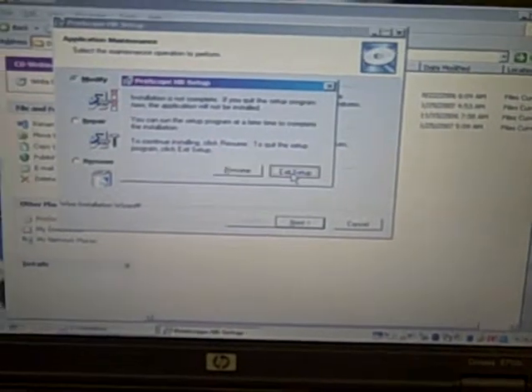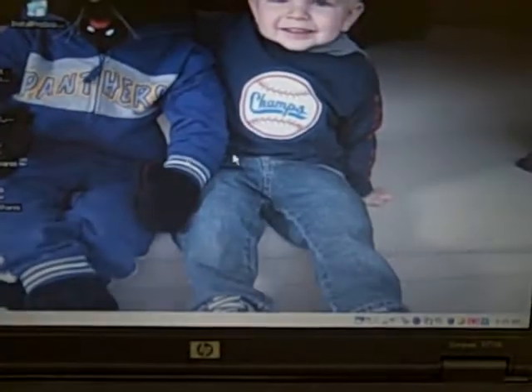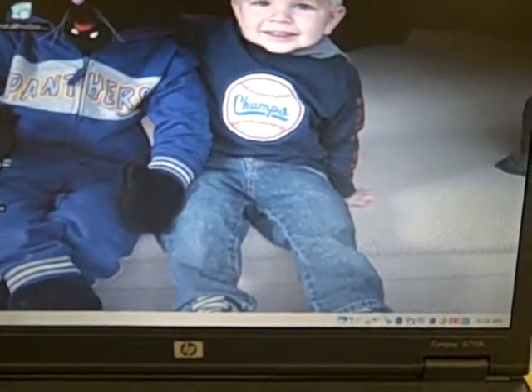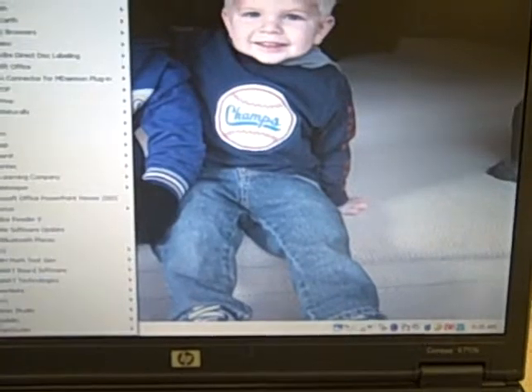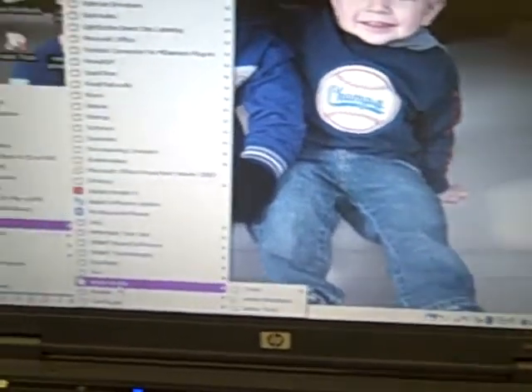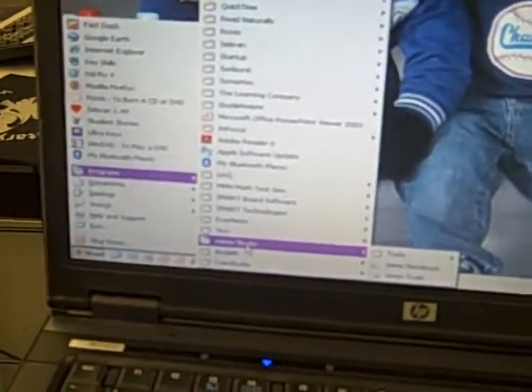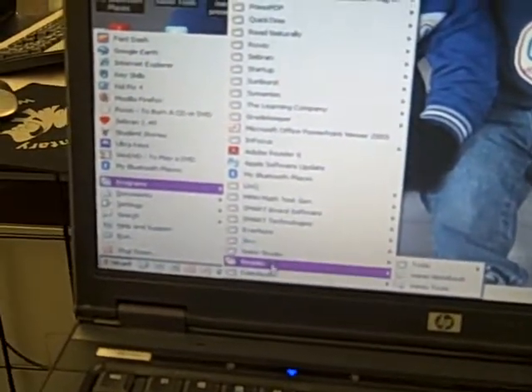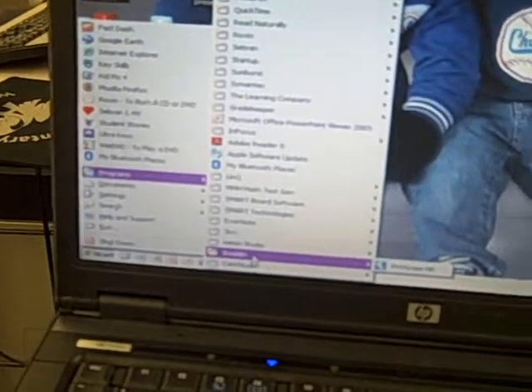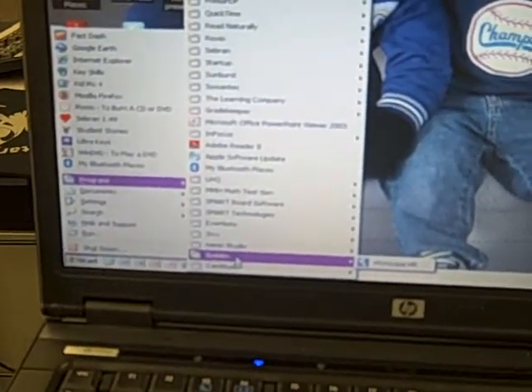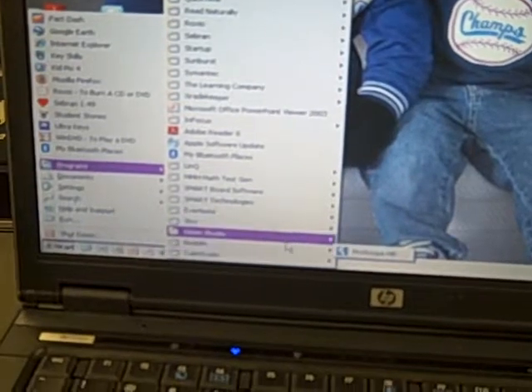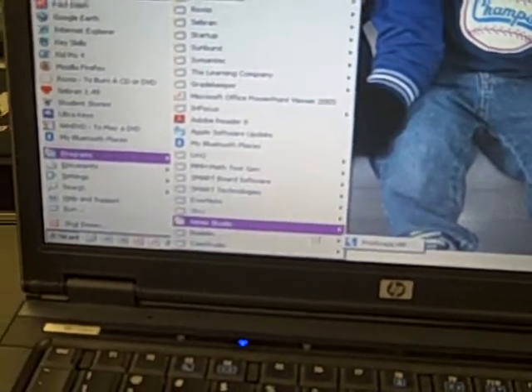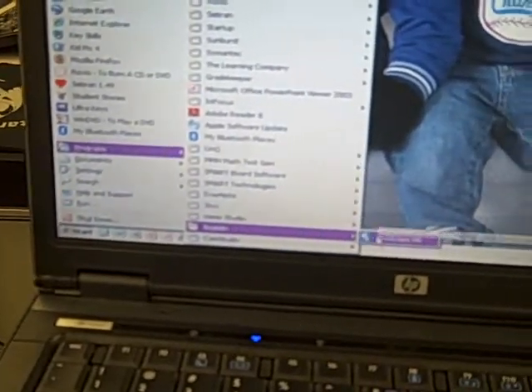I've already done this, so I don't want to do it again. You're going to close out of that, and you should be ready to start. You go to the Start menu, Programs. The software is from a company called Bodolin, and so you're going to find that and then open up the icon that says ProScope HR.